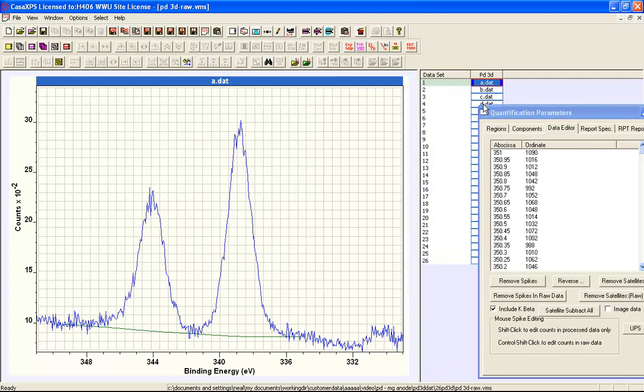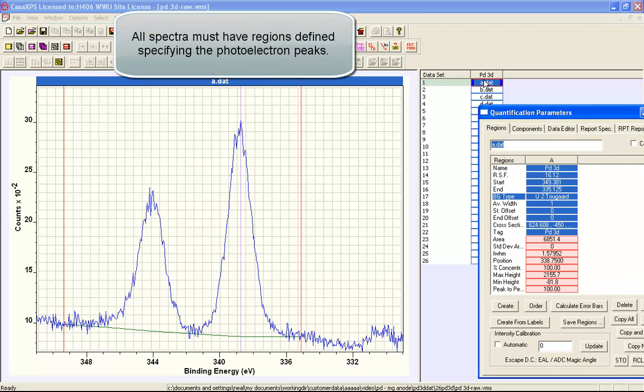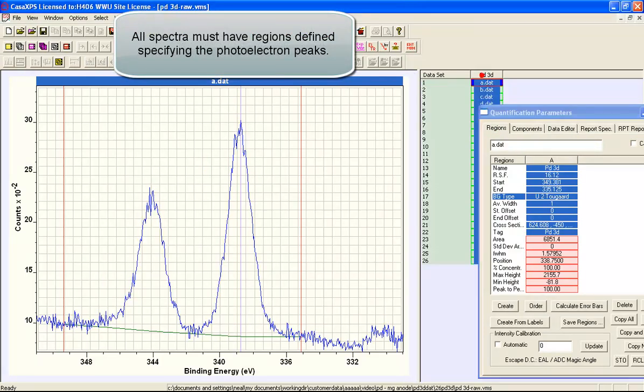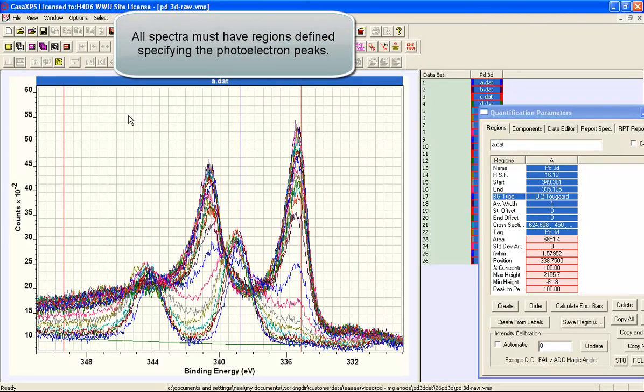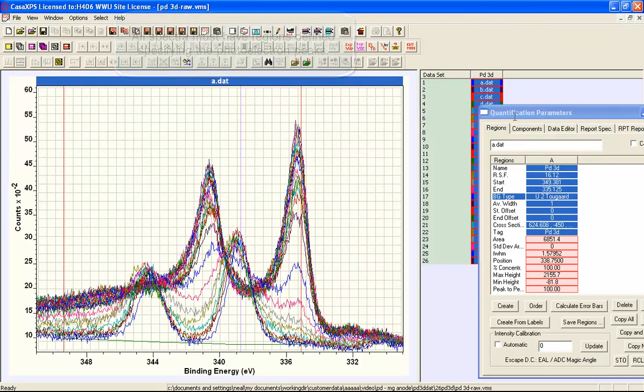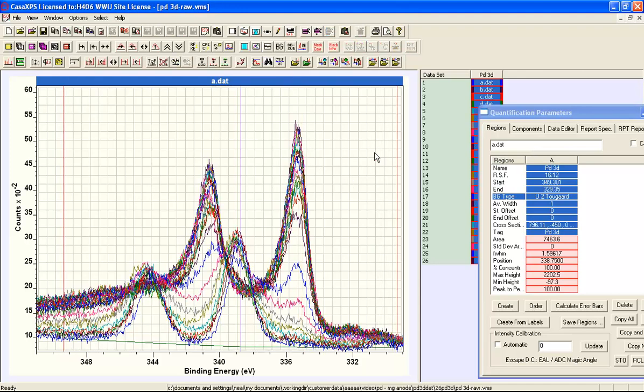The data set contains not just one spectrum but it has a set of spectra all of which contain satellite information that we would like to process out of these data. So if we go to the regions property page and then we'll just adjust the region so it spans all of these spectra and propagate.